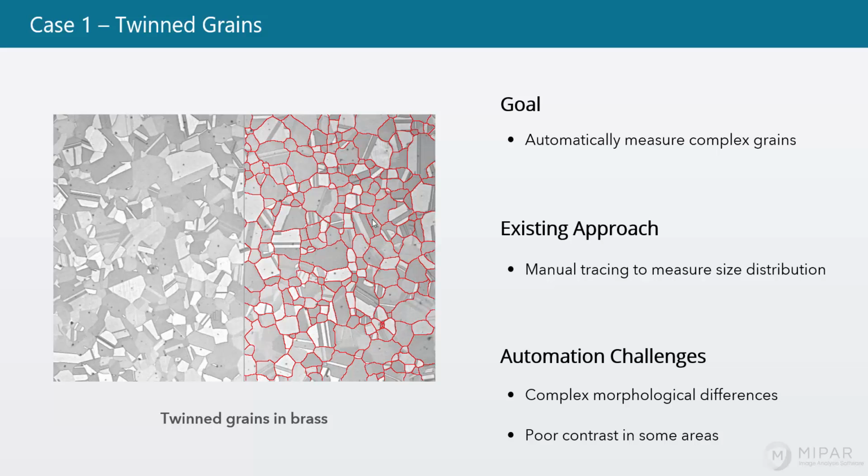So historically, this has been done purely manually. If you're just looking for a mean grain size, folks will lay down a set of random lines and count off the intercepts and get a mean size that way. This particular client needed a full size distribution, and even though going with EBSD would have been more unattended, the time cost and sample prep challenge involved caused them to just sit down and trace all these boundaries by hand so that they could get a full, grain per grain size distribution measured.